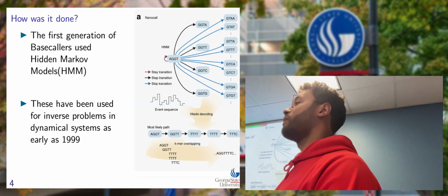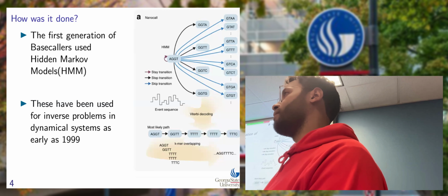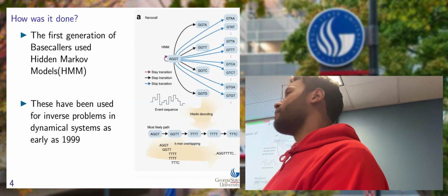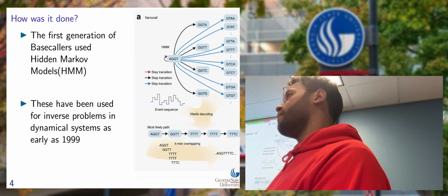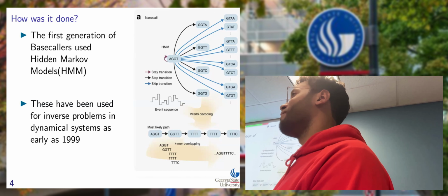That's correct. That's why we need frame reading rather than single readings: a bunch of readings represent several characters, and then we use those to monitor how the signal behaves. That's the second thing. Third reason, what could be?